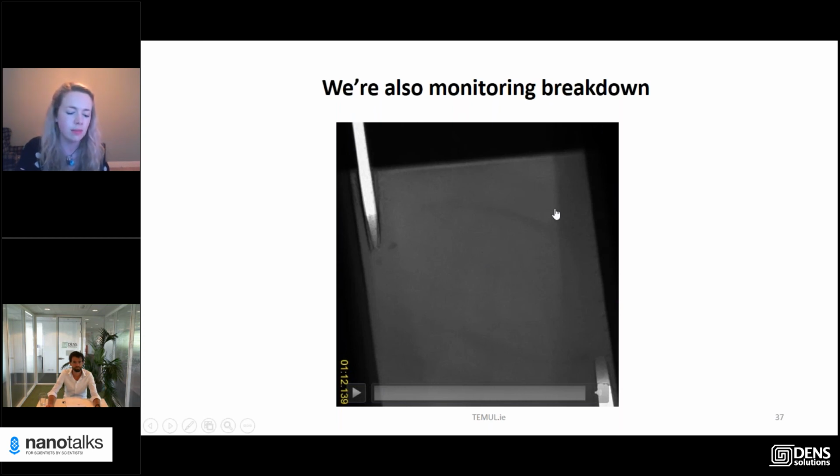That's what I did for the copper chlorine boracite, and it seems to work. That's what's worked so far. I also did this with lithium niobate, which is a different type of ferroelectric, and that seems to work much better as well. So definitely cut those, otherwise you just get your current across your protection layer.